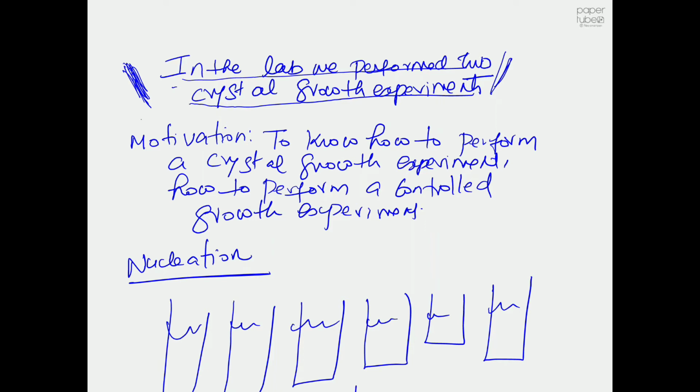In the lab, we performed crystal growth experiments. I think only now we are going to cover the real topic about your laboratory experiment, that deals with crystal growth of paracetamol. And then we monitored the whole crystallization process using PAT tools. So normally, as they call in industries, we can call the title of your lab experiment PAT assisted crystallization. And the main motivation, obviously, you should know everything about PAT tools and what they can do and what are the key advantages of PAT tools.